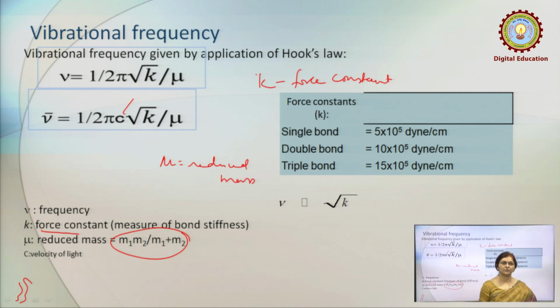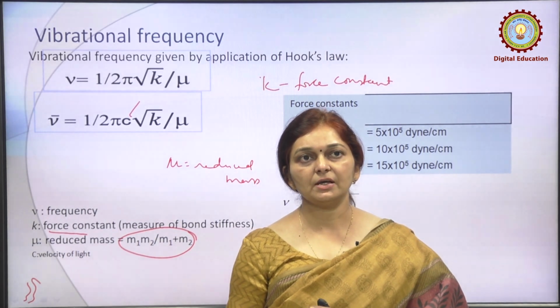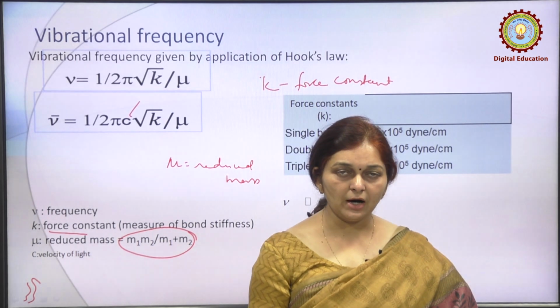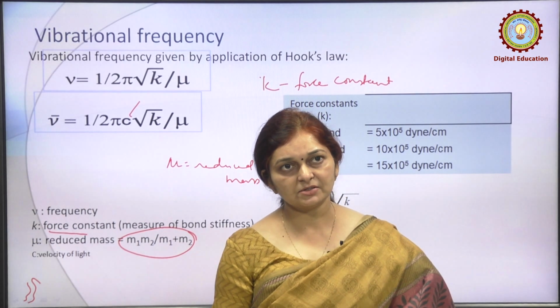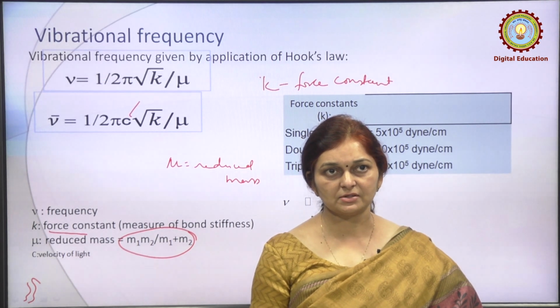This vibrational frequency is very important in infrared spectroscopy. With the help of the vibrational frequency, or absorption frequency, or wave number of absorption, we can easily determine the given organic compound whose molecular formula is given. We can establish the structural formula on the basis of vibrational frequency.